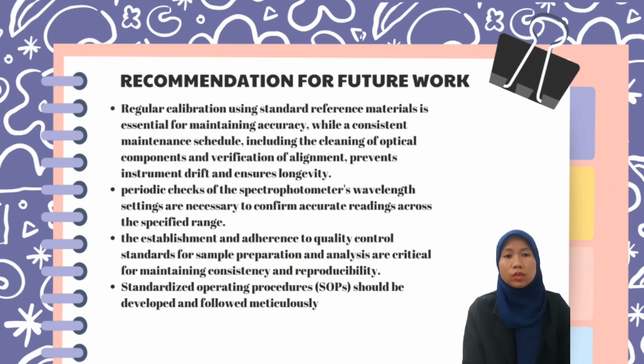First of all, regular calibration using standard reference materials is essential for maintaining accuracy, while a consistent maintenance schedule, including the cleaning of optical components and verification of alignments, prevents instrument drift and ensures longevity.